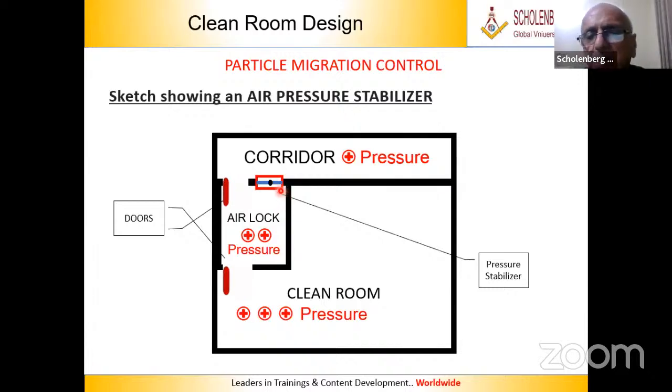So this pressure stabilizer is used. If you're going to carry material, I have a trolley. I'll first operate the stabilizer, open the door. No, the door will not close. I've used this instrument out here. Bring in the trolley, then reoperate this, then the door will close. Pressure will increase out here and close the door.